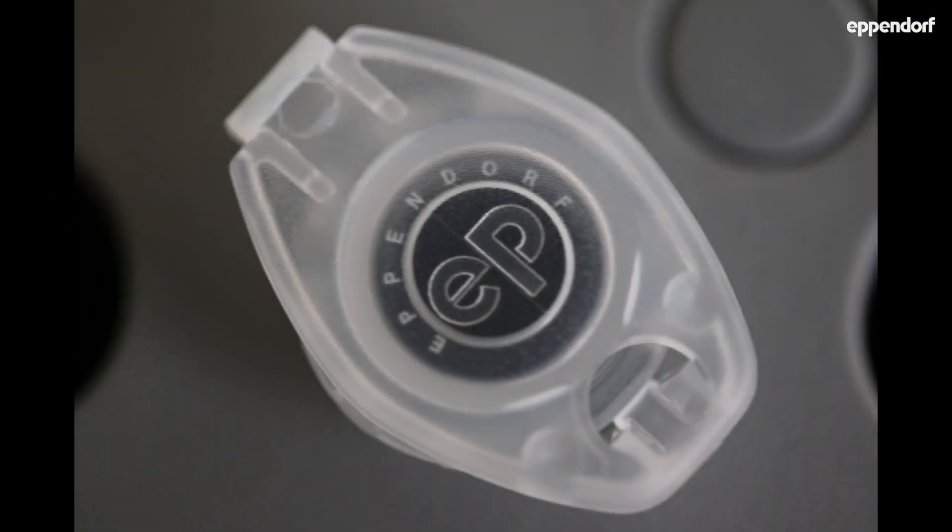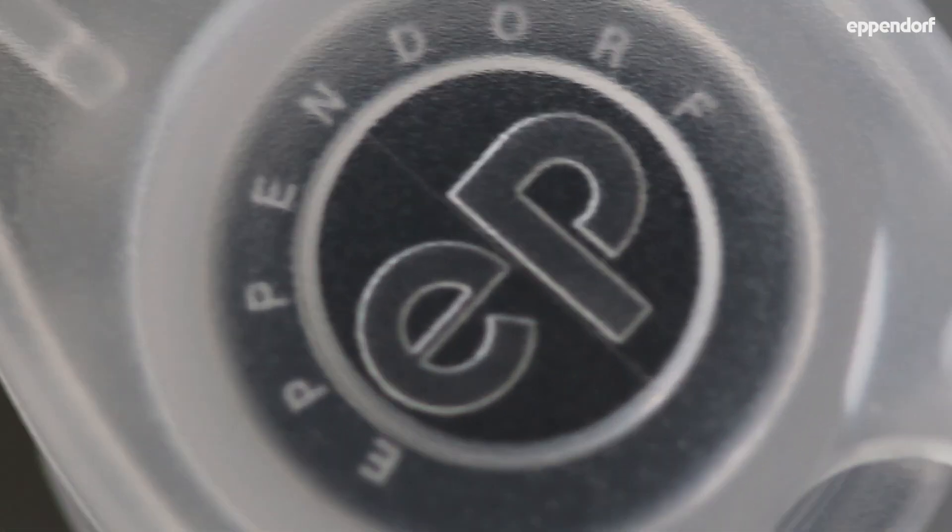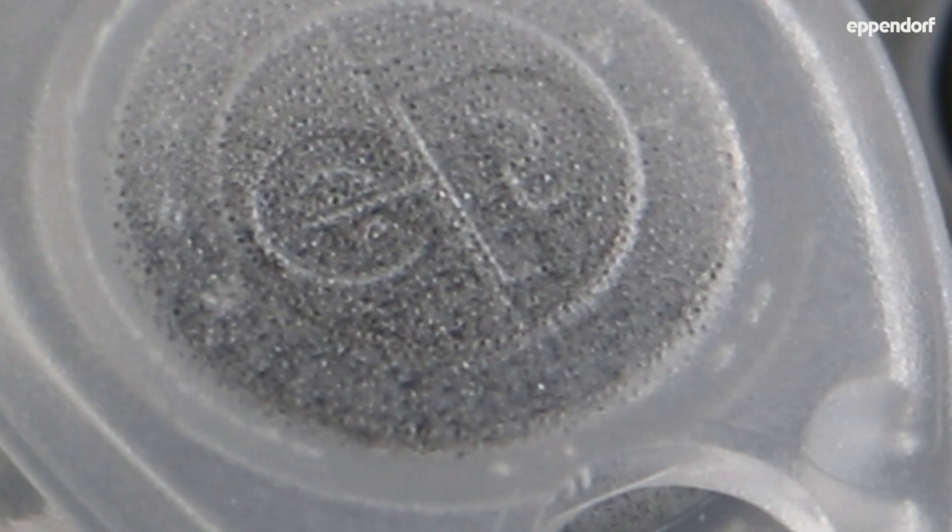Here you can see a tube at the beginning of the incubation. When no thermotop was used, condensation droplets began to form after a few minutes.